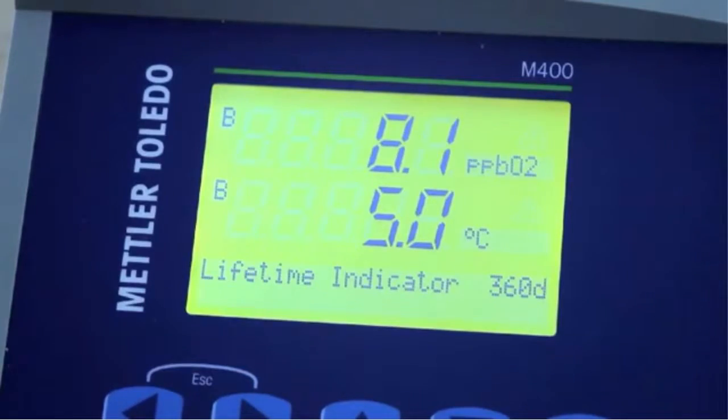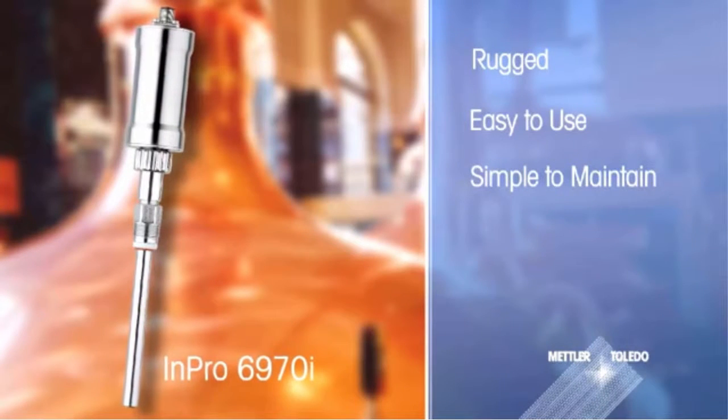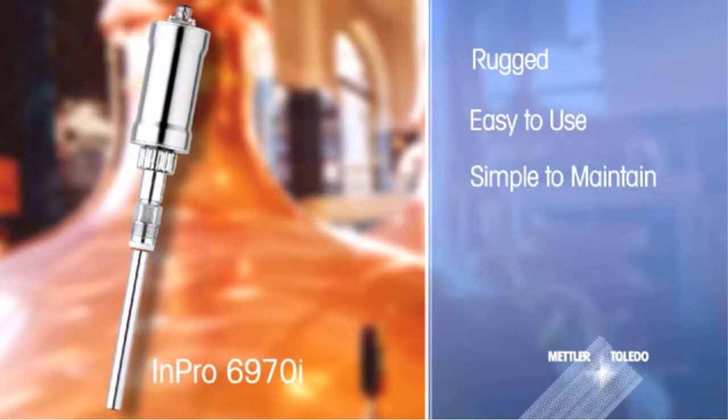But it is not the only requirement that breweries demand. Sensors must be rugged, easy to use, and simple to maintain. The InPro 6970i scores highly in all these areas.